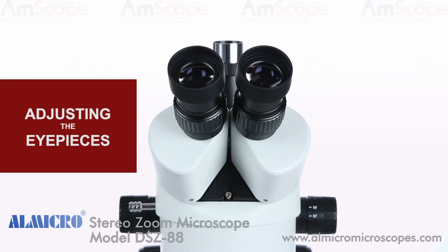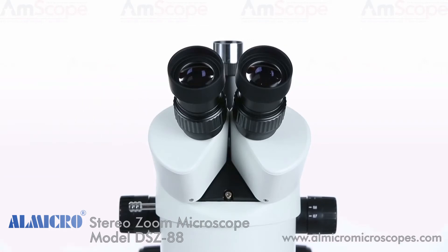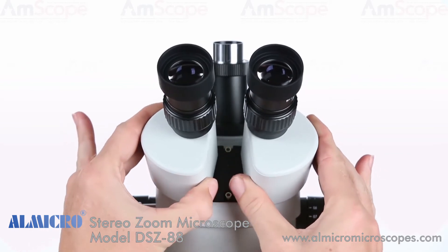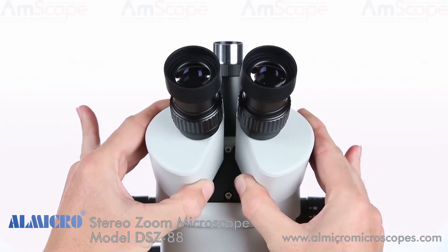To adjust the distance between the eyepieces, simply take hold of each inner pupillary adjuster and gently pull them apart. While looking through the eyepieces, find a position that offers a comfortable field of view.